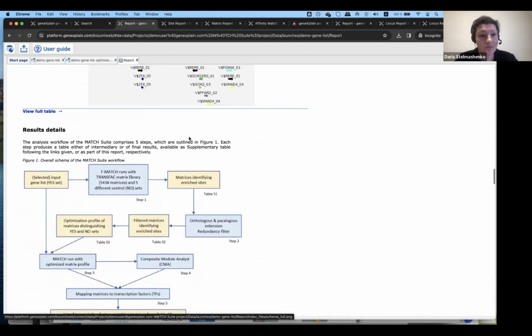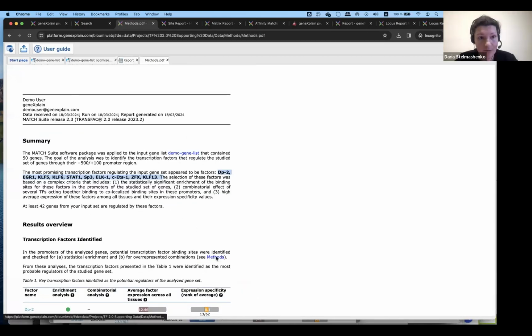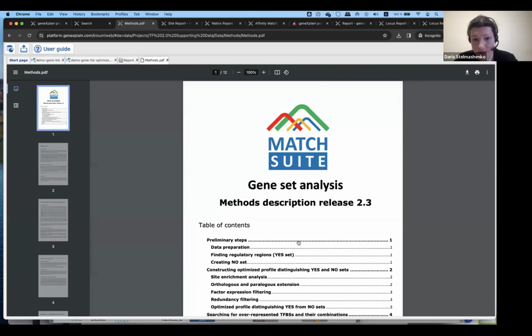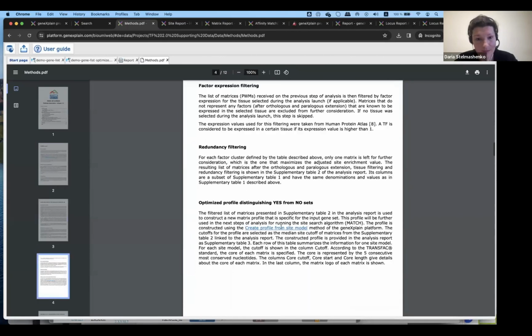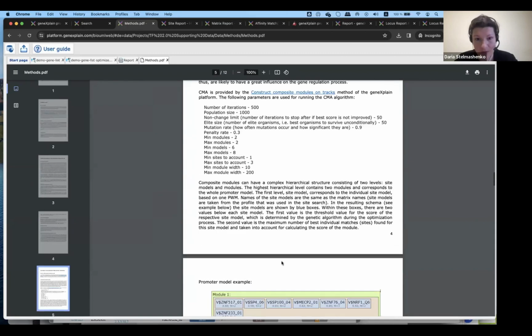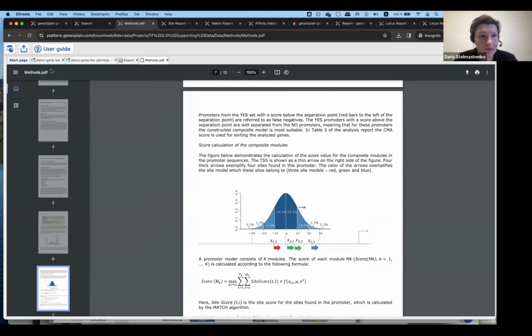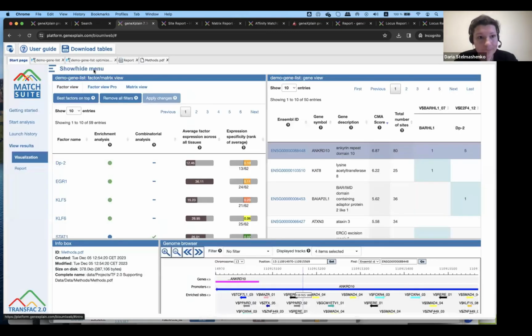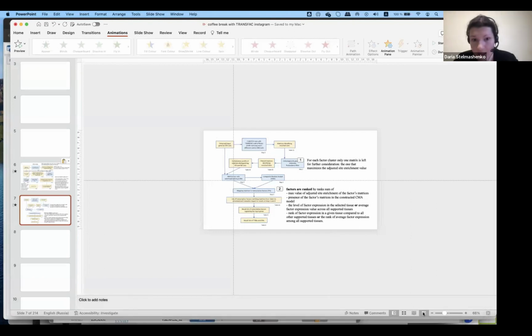And of course, you have the links to the methods. I think, yes, from the very beginning, you just click on these methods and everything is described absolutely in all details, whether you have applied any additional conditions, how they will be used, and so everything will be in this method section. So now we're going to just briefly look at the analysis pipeline.